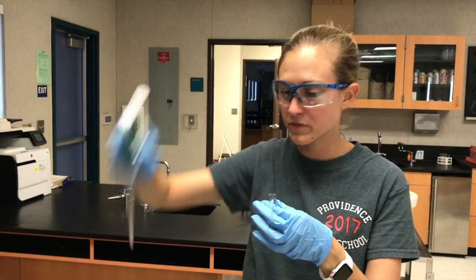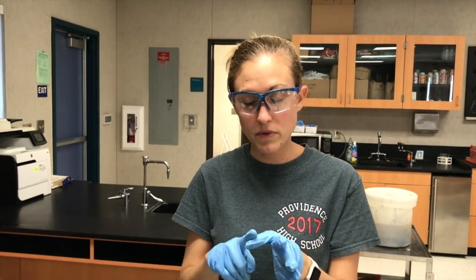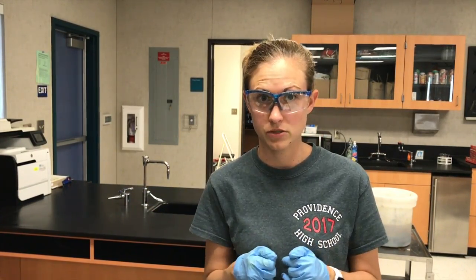So I've got one of the 4 solutions that I need to dilute. And you're going to do the other 3 calculations. Okay? So what you'll have in front of you is a total of 5 solutions, one with a 0.4 molar and then the other 4 that you created. Once you've created that, then we can go over to the spectrophotometer and use that to actually measure the absorbance and compare that with concentration.